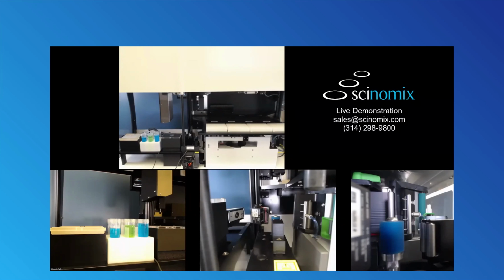So before we get this started, what we're kind of looking at here, this top image, is the Scinomix AQ on the left and the Scinomix VXL on the right. We do have a bulk feeder to the right out of camera that's going to be feeding tubes into the system. Bottom left, this is the aliquoting module. This is where you're going to see that pipette filling. It'll do a 750 microliter aspiration.